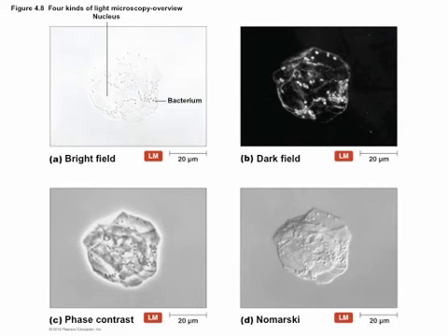And then they'll move to another technique if they need to. But I would say, for most bacterial applications, phase contrast is the default. This assumes that you're looking at unstained cells. If you're looking at stained cells, you want to be using bright field.